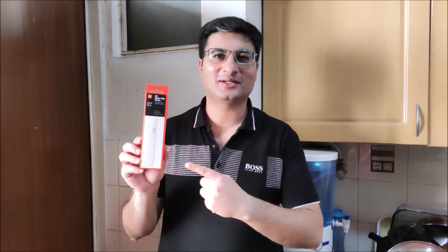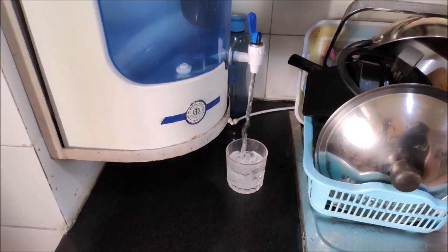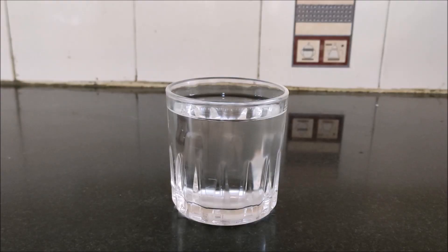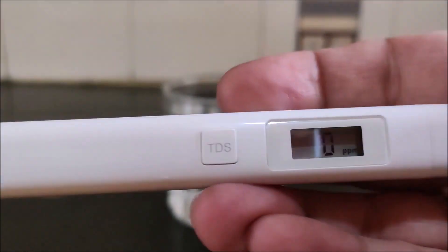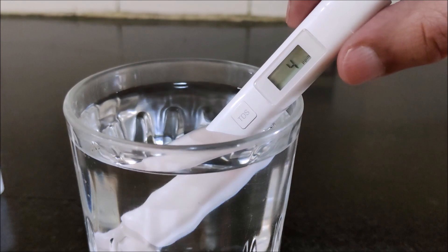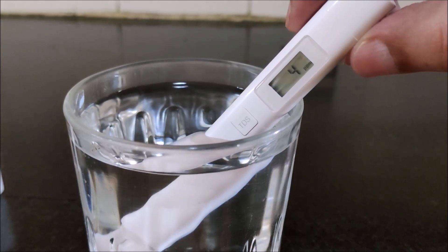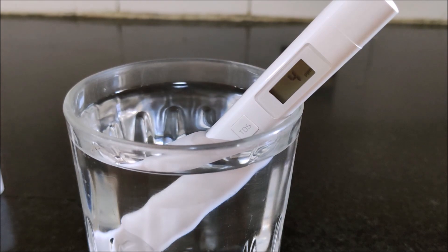Let us now see the product in action. I am taking RO water in a glass. I have a choice to take the water in the cap provided or dip the device directly in water. I will switch on the device and dip it in the RO water. The TDS reading is showing 4 ppm — that is too pure, just like distilled water with no minerals.